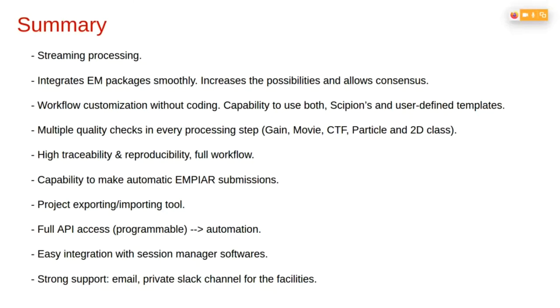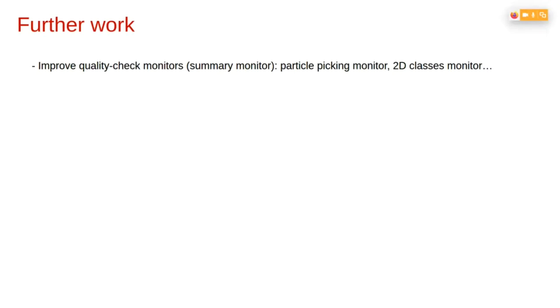For further work, we are working to improve the quality checks because we understand that is the most important thing for the facilities, because the quality of the acquisition is the important thing here. So we are working to include a particle picking monitor and a 2D classes monitor.